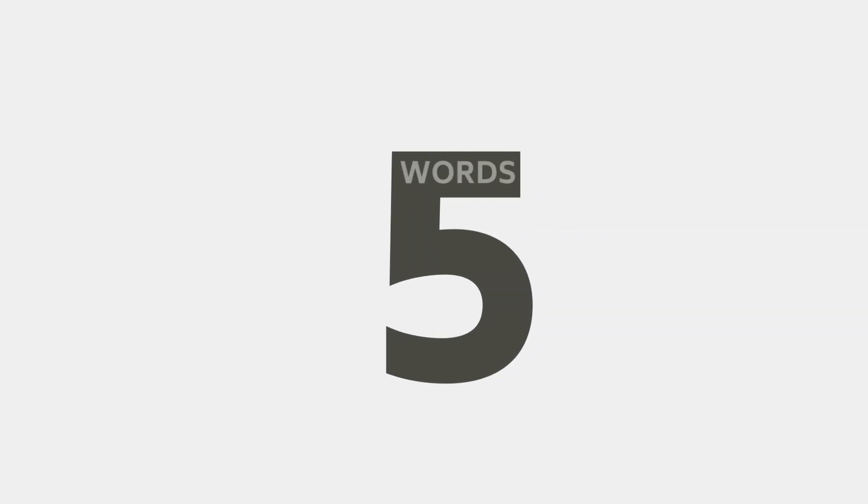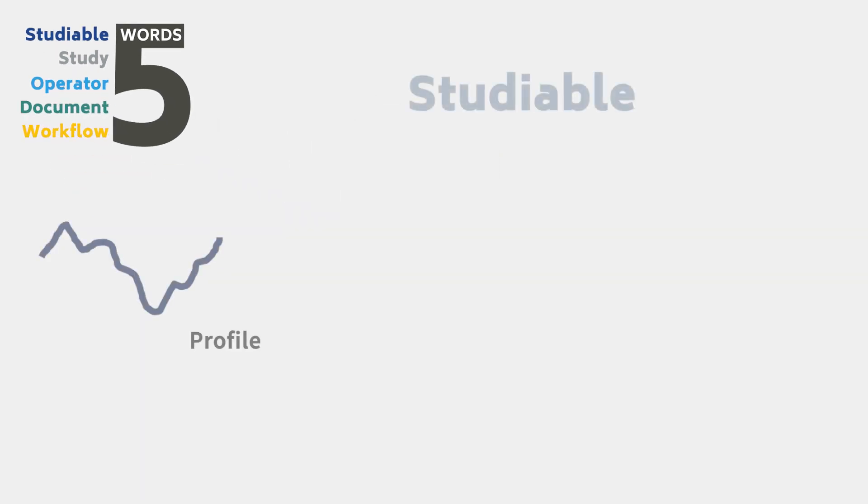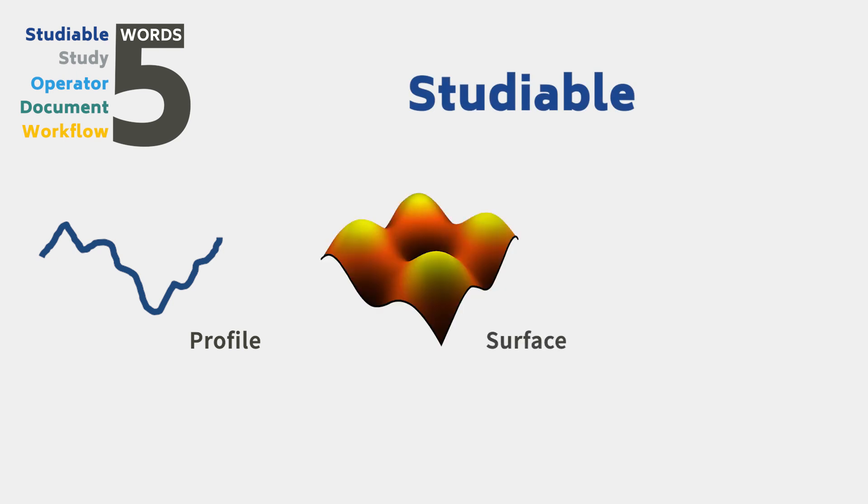There are five words you need to know before you begin to use MOUNTAINS: Studiable, study, operator, document, and workflow. A studyable is any type of data that can be analyzed using MOUNTAINS.